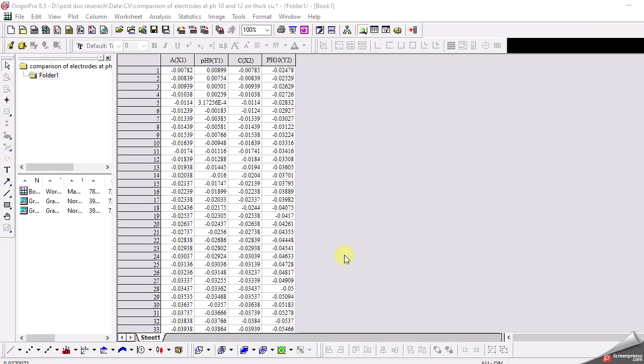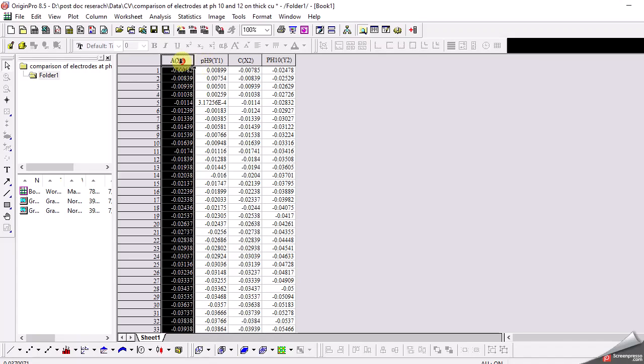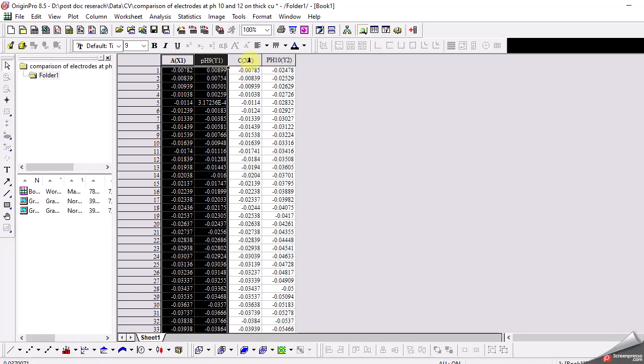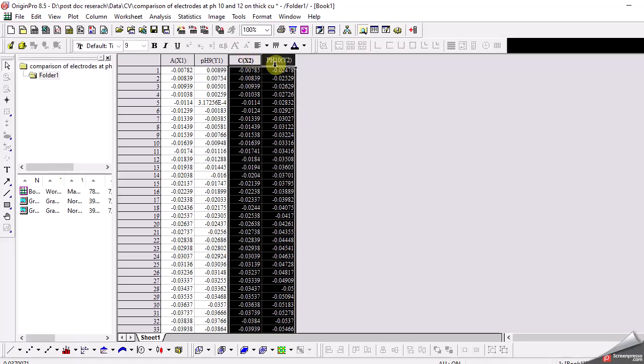Today we have data from cyclic voltammetry, which is a technique where we have voltage and current data for a sample. We have four columns with data from two samples. The first sample has voltage changing on the x-axis and current on the y-axis, labeled pH 9 because the sample was prepared at pH 9. The second sample is similar with voltage and current.